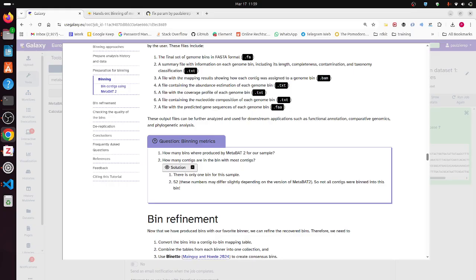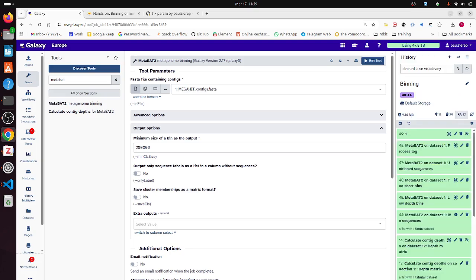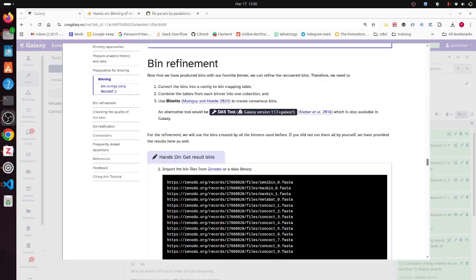So that can change slightly. Also, because internally MetaBAT has a non-deterministic approach, you can see in our case we found some more bins, and that's one of the caveats of metagenomic binning: between algorithms some slight difference can often happen, also depending on the deterministic method which underlies this process. I will in this tutorial not go into the details of each of the binners.